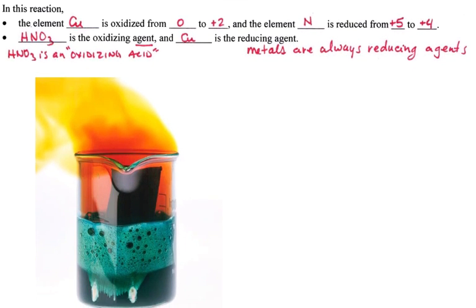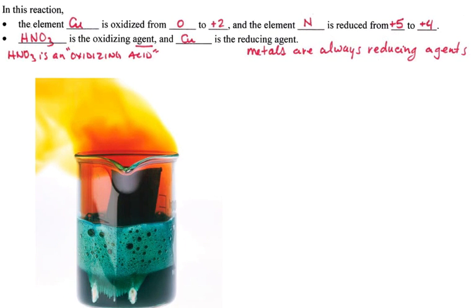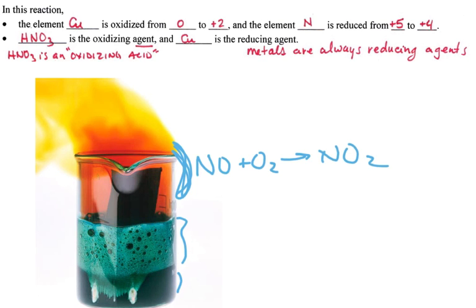Now the reaction itself, it looks like this guy down here. Now this is not the way we did it. We did it in a Florence flask. But initially, you got all this foamy stuff, and it was very dark. But when the water came back in later, we had a really pretty peacock blue solution. We were making a gas up here, and we know that that gas, I believe, is actually NO, but when it mixes with the oxygen in the air, it turns into NO2. So the NO2 gas is the reddish-brown toxic gas.